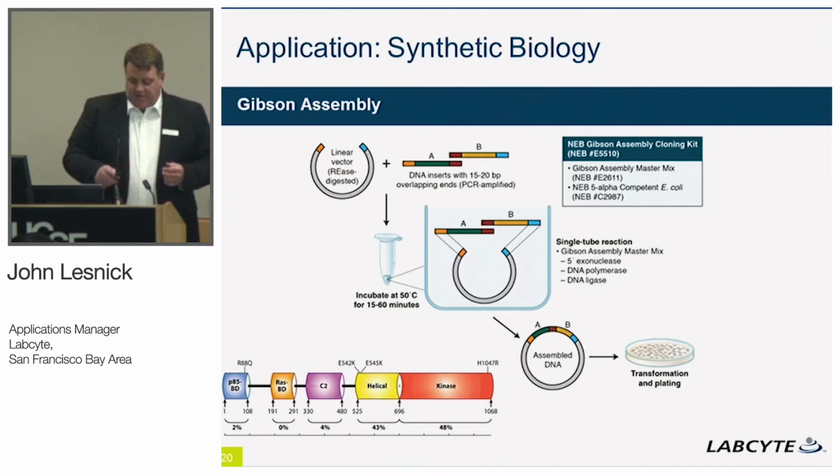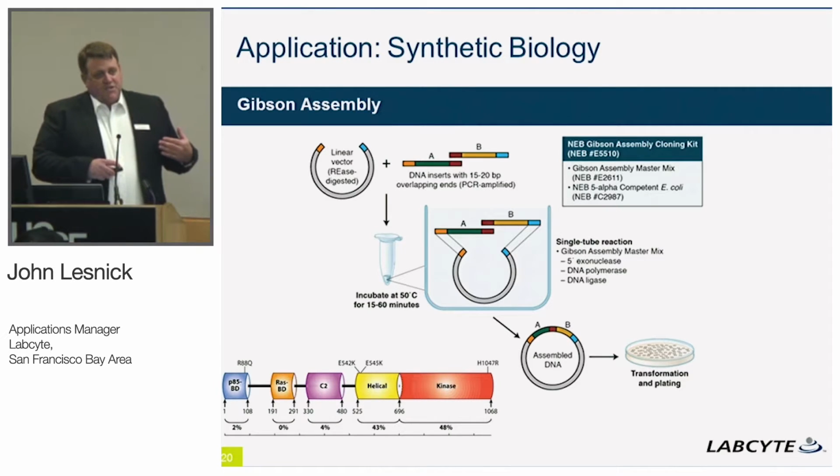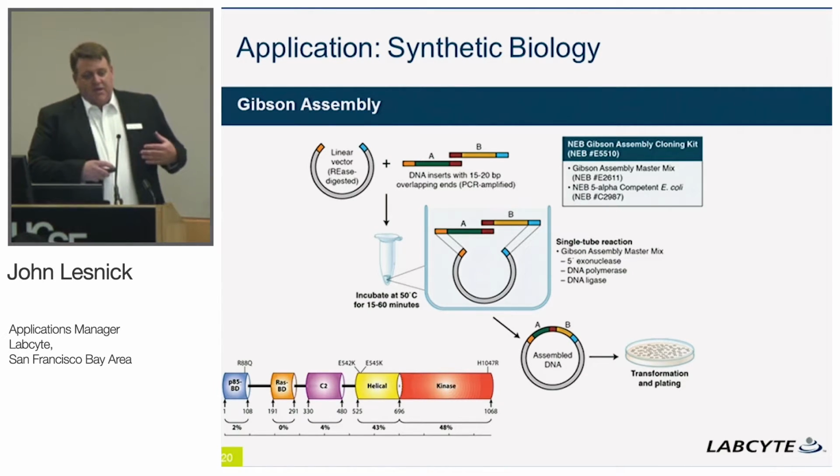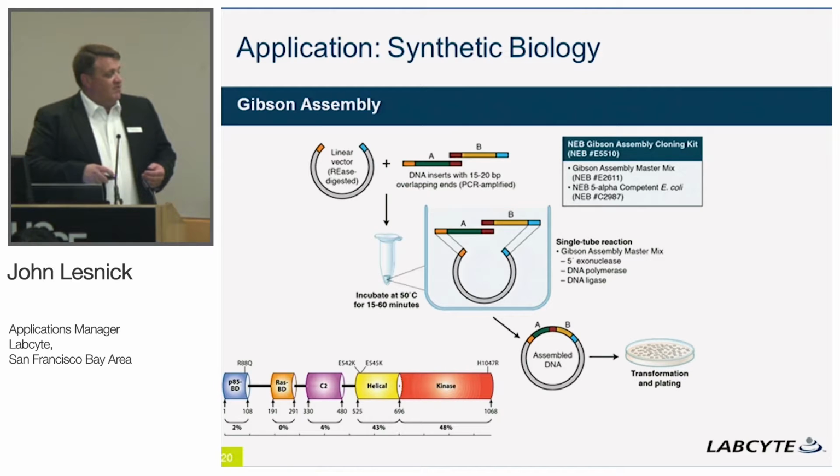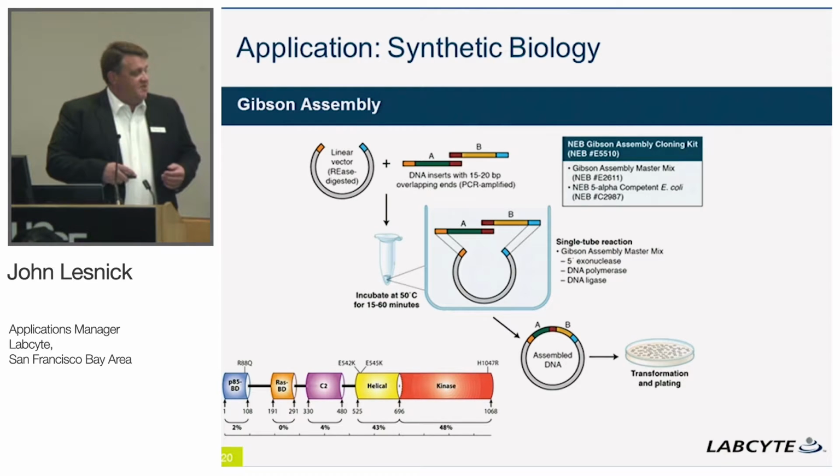Now, in the case of real-life application, one thing that's important is, as I said, multiple mutations can occur within the same system, at least in breast cancer. So if we wanted to really interrogate this system further, we're going to be looking at different systems that have both the E542K as well as H1047. This is a really fast way to piece together this piece of DNA and that piece of DNA, mix and match your mutations, and then you can develop protein.